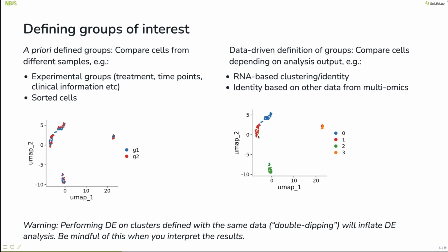I typically wouldn't because, as also mentioned, the algorithms for clustering and UMAP aren't the exact same, so this will happen to some extent, and both of them tell some story, the UMAP and the clustering. If you find that it's a large proportion, then you might want to go back and redo your clustering or UMAP to see why they're doing this.